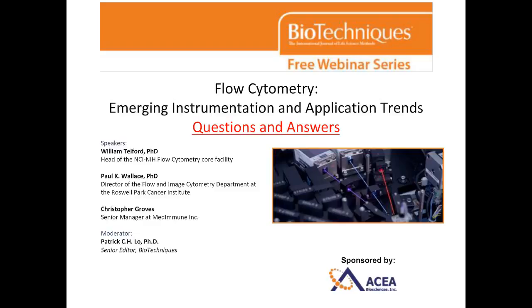Yeah, that's an interesting question. A lot of people do have problems with the lipophilic dyes, the membrane labeling dyes, in the sense that they can be very difficult to work with. They're not as easy to work with as the protein labeling dyes, and so typically it's a technique thing. And what I can say is that I could point people to a JoVE video.